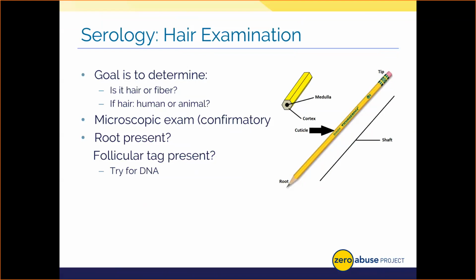What are some of the features then that we see if a hair is human, right? Well, the cuticle will have an imbricate pattern, which kind of looks like cracked paint on a house, in my opinion. The cortex will have an even color, pending that the individual did not frost or dye their hair, within the length of the hair shaft. The coloration will typically be darker towards the cuticle or outer edges of the hair shaft, but redheads, for whatever reason, they can be an exception. Red hair has been shown to have darker coloration in some cases towards the medulla. Now, I don't know the biological mechanism behind that, but if you have red hair, one of my daughters has, just consider yourself very unique.